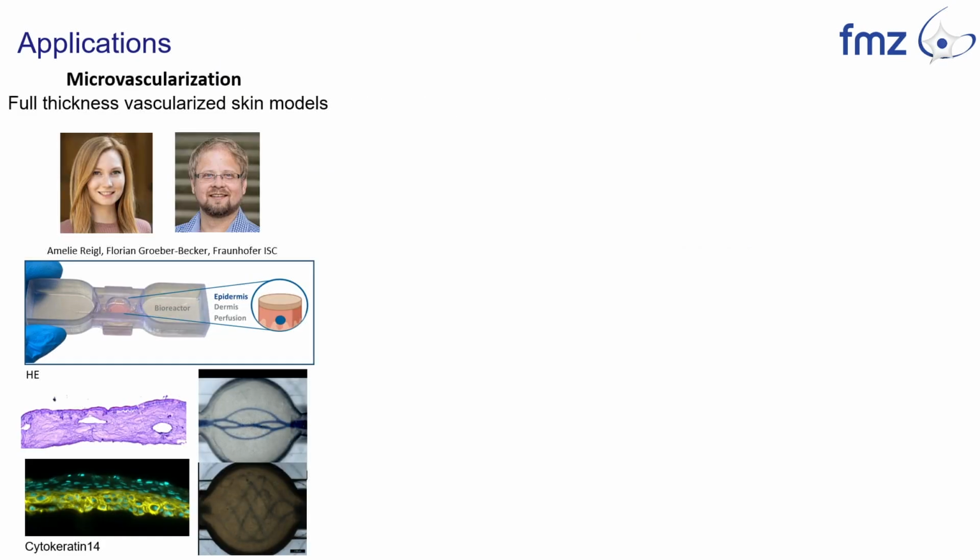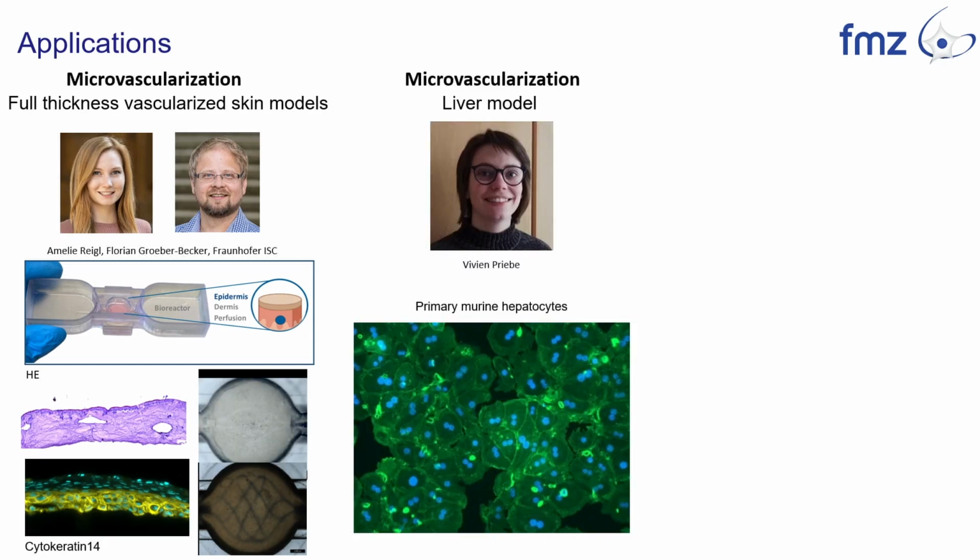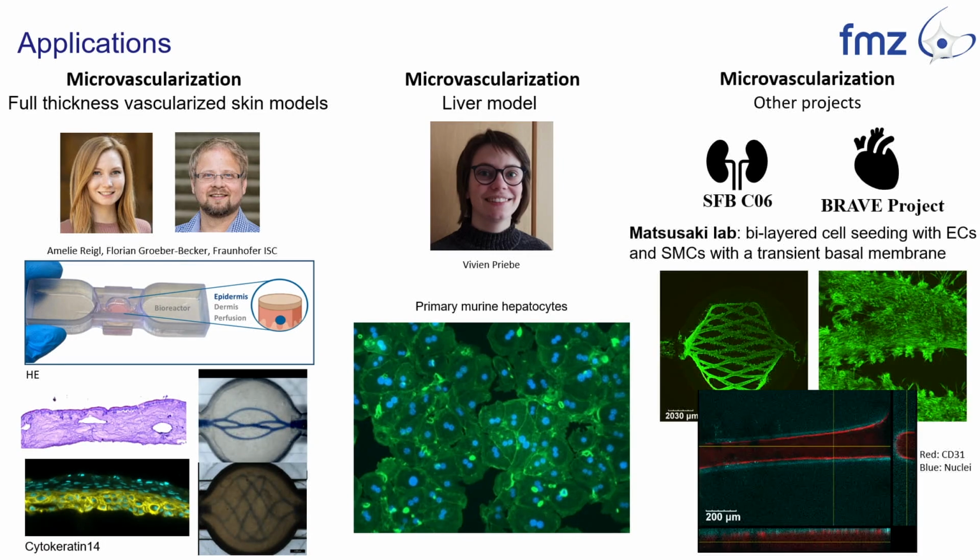So at the moment, there are many projects ongoing. For example, we do microvascularization of a full thickness vascularized skin model together with the Fraunhofer Institute in Würzburg. And this project is actually quite far right now, so we are able to generate these perfusable skin models, and we are actually going to add endothelial cells. We are also working, but this project has just started, on a liver model with primary murine hepatocytes, and we also have international cooperations for kidney, heart, or with our Japanese collaborators from Osaka.